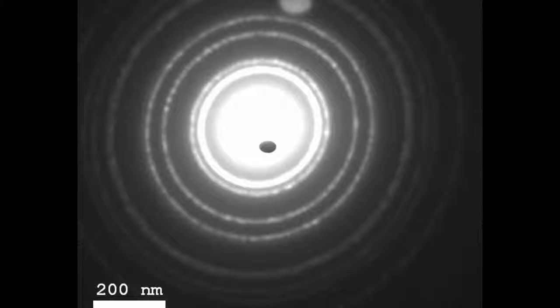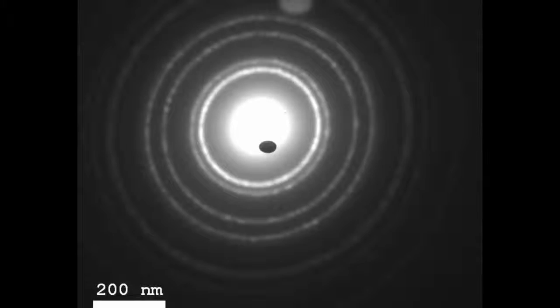We can view this back focal plane directly in the microscope, and here I do that. What we see now is a ring pattern. And this ring pattern is caused by this Bragg criteria. So some of the electrons will emerge due to this crystallinity of the sample at different locations outside the central part of this image. The central part, the inner dot, that is the unaffected transmitted beam that only produces this absorption contrast.